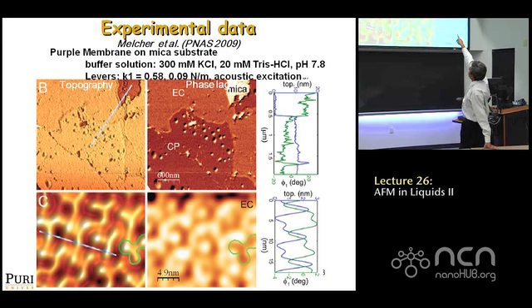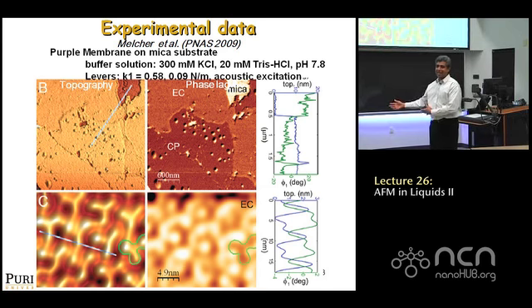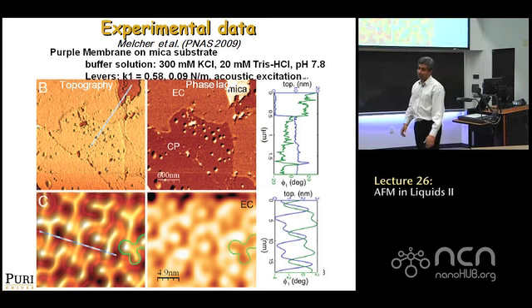And then you got a bit of mica, and in the phase lag image, sure enough, mica is the brightest, which if you took your traditional understanding in air, would say phase lag is greatest, most energy dissipation in mica. If you just used your understanding in air to interpret this, you would say, oh, there's more dissipation in mica. Mica is more viscous than this biological sample or something like that, which of course is not true. It is true the energy loss is greater, but the reasons for energy loss are not due to viscoelasticity, but rather you just get a lot more ringing transferring to internal degrees of freedom. That's where the apparent loss is coming from.